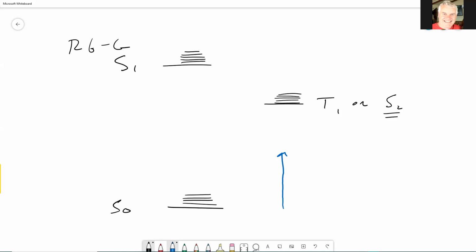This may correspond to, say, 800 nanometers or something like that. And then as we scan down to, say, 200 nanometers, then we're going to wind up with a higher energy, which is greater than most of the S1 levels that we're going to look at, right?